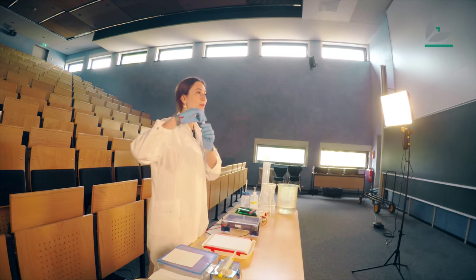Hi, I'm Asaides. Here I have a sample with DNA fragments in it. I want to find out if my gene of interest is in it, so I'm going to use the Southern blot.